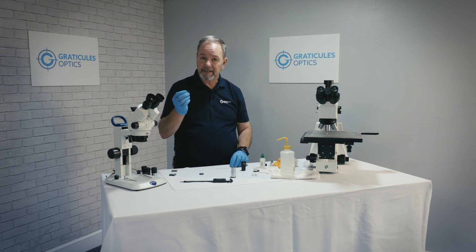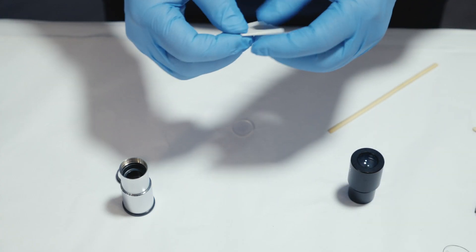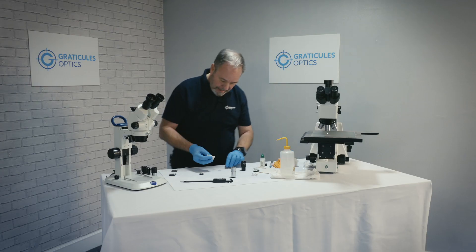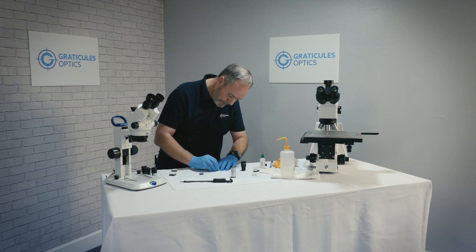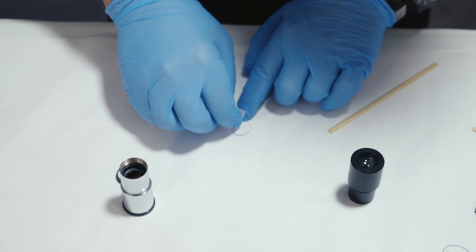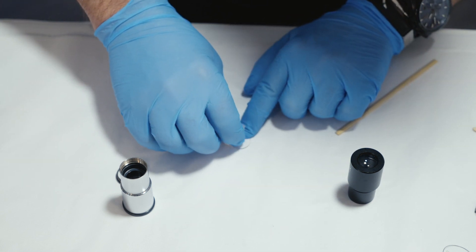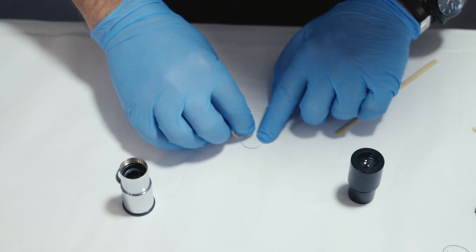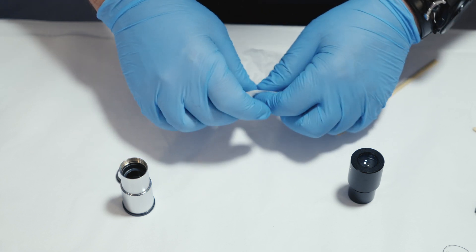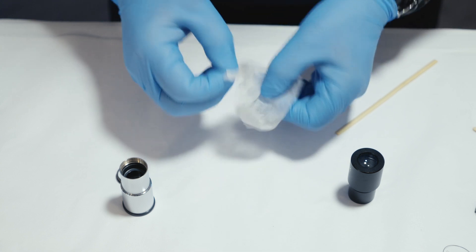First I'm going to clean the reticle using a piece of lint-free tissue. We fold the tissue into quarters or eighths so we get a nice corner that will be our cleaning surface. Apply a little cleaning fluid and then, working on the reticle from the center in a rotational manner — center to the outside — remove all the dirt and debris. Then reverse and do this on the other side as well. Finally, clean and dry with a fresh piece to make sure we remove all the moisture. If the fluid evaporates on the glass we'll be left with a watermark, so it's important we dry it properly.